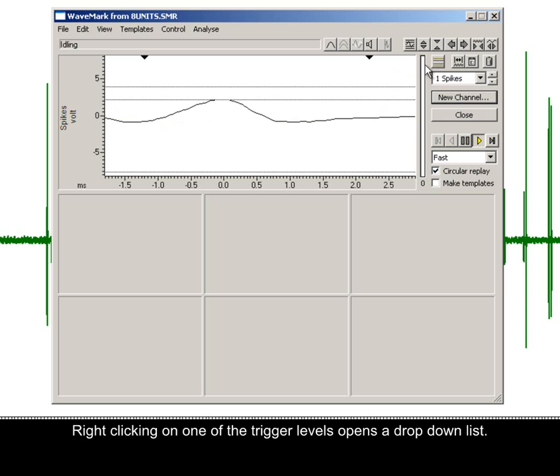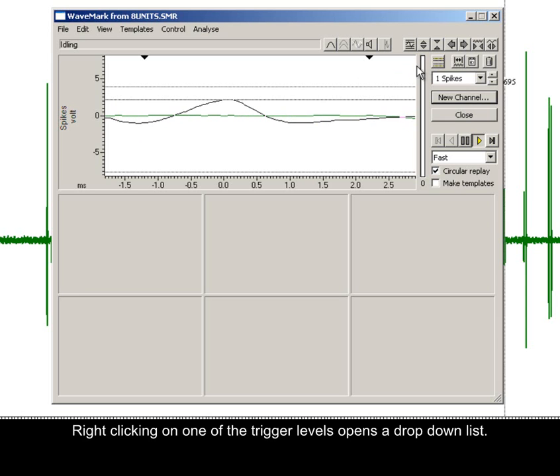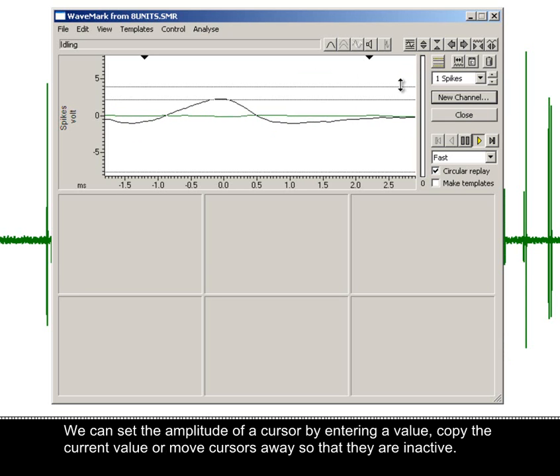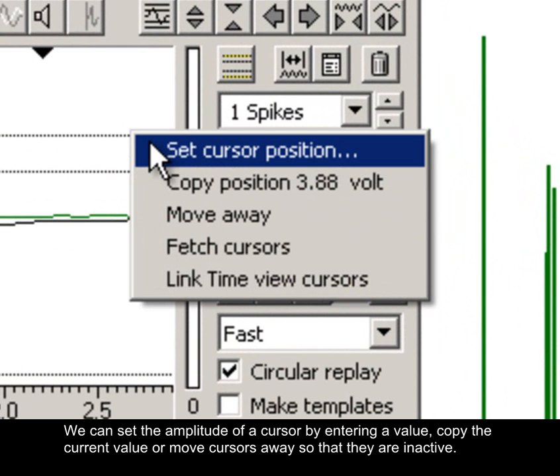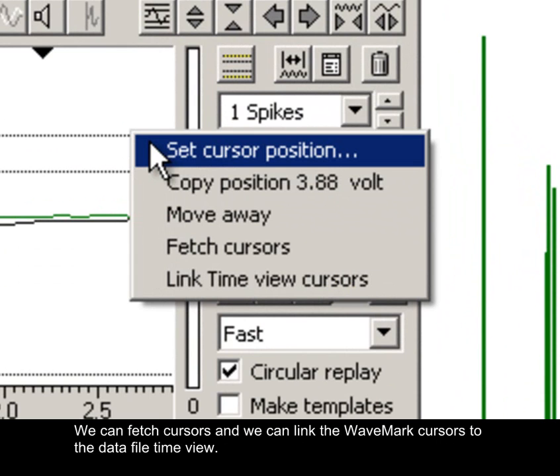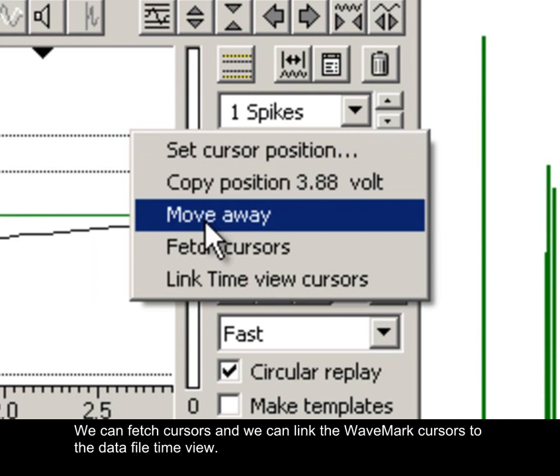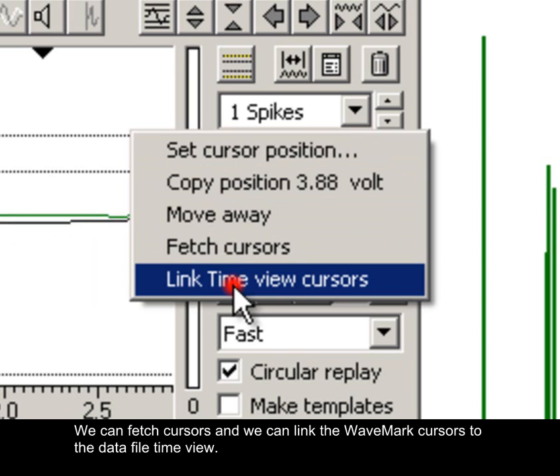Right-clicking on one of the trigger levels opens a drop-down list. We can set the amplitude of a cursor by entering a value, copy the current value, or move cursors away so that they are inactive. We can fetch cursors and link the wave mark cursors to the data file time view.